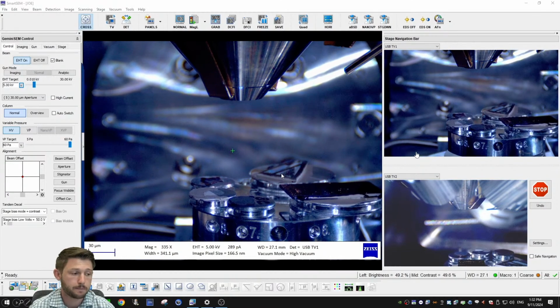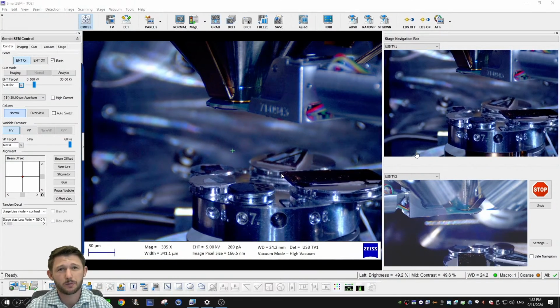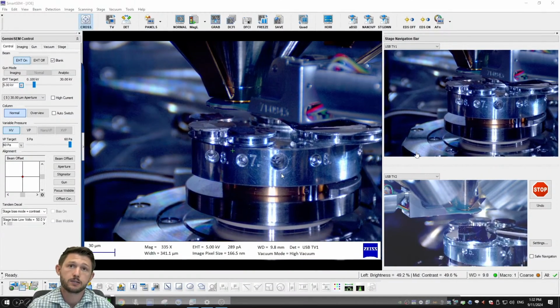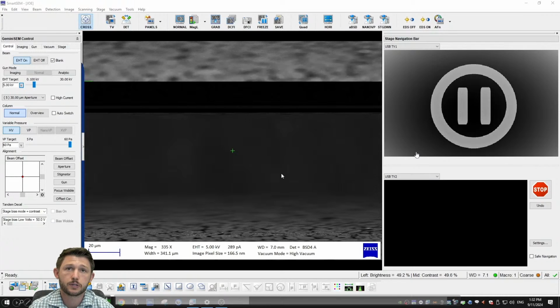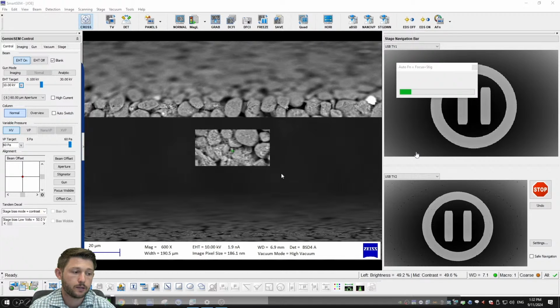It's going to insert the detector. Once the detector is inserted, it's going to bring the stage back to where it was and then change our imaging conditions to typical backscatter electron imaging conditions. A little bit higher kV, higher current, of course selecting that detector and making sure that we can see the signal that it's capturing. As we've moved the stage, performing the autofocus and autostig is recommended, which is what's shown right now. And then once that settles, you'll see that we're at our working conditions, all just by clicking that yes button.